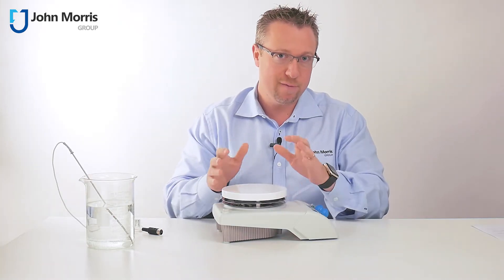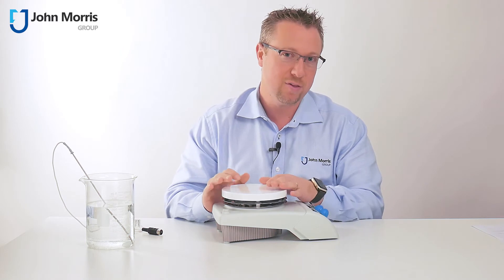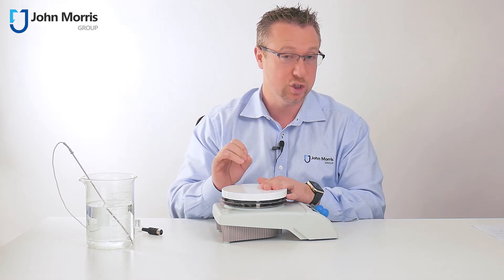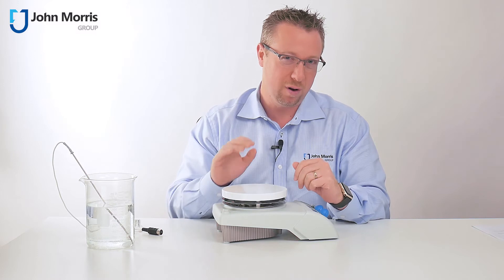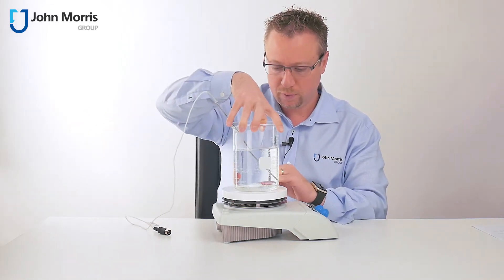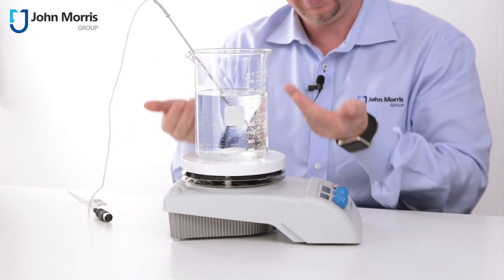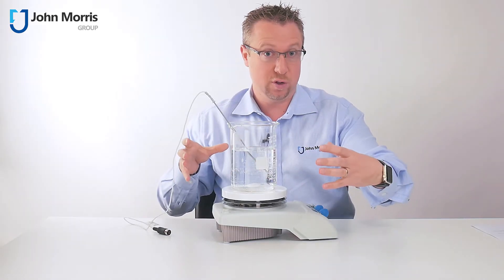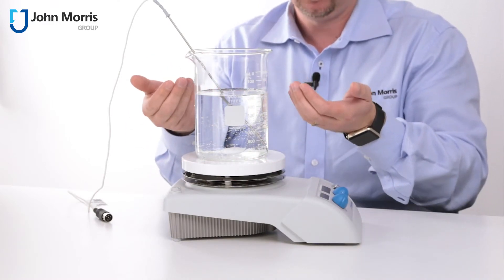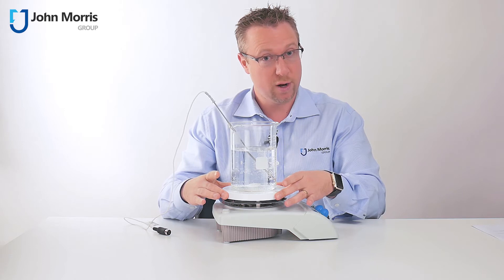The overall unit itself is IP42 rated, and we're talking about temperatures up to realistically boiling point. They say 370 degrees, but if you're working with water, you will never get above 100 or even probably reach it. Generally work below the boiling point of your fluid, particularly if you cannot get the heat into the fluid. If you have a lot of fluid sitting on top of this hotplate magnetic stirrer, you've only got one area where you're conducting heat into the fluid, and you're also losing heat through the sides of the vessel. In this case with water, you probably won't get above 95 degrees C, even if the hotplate itself is rated to 370.